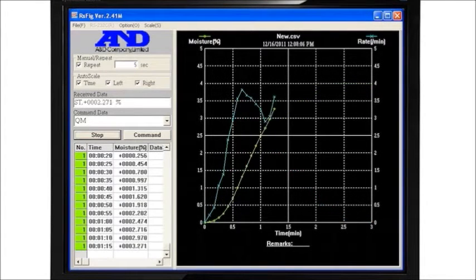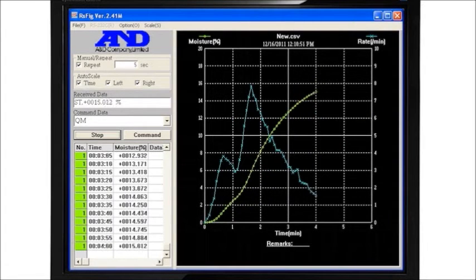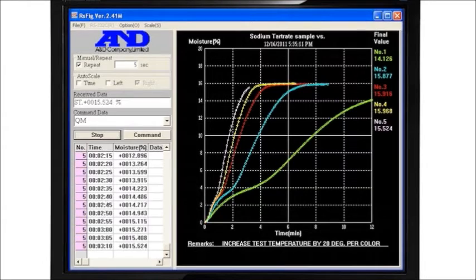WinCT plots moisture content as it reaches its final value and the change in moisture rate approaches zero, indicating the sample is now dry. Successive measurements at different temperatures are graphed in different colors.